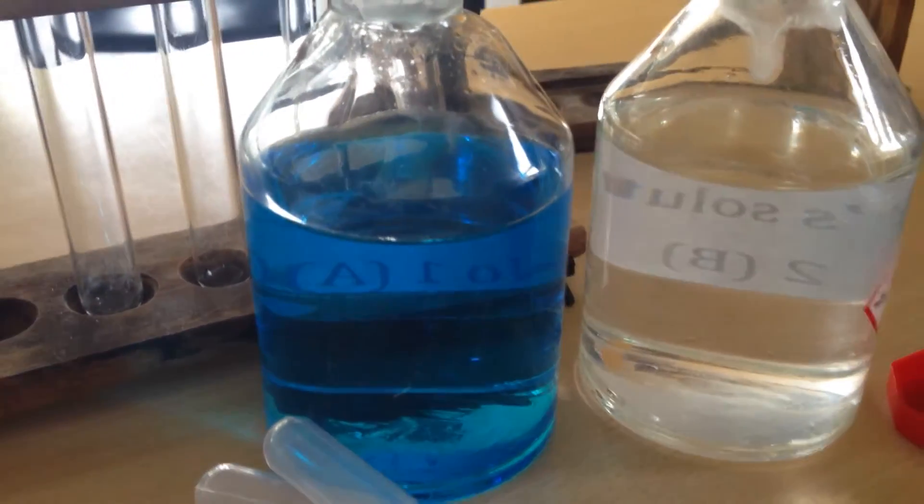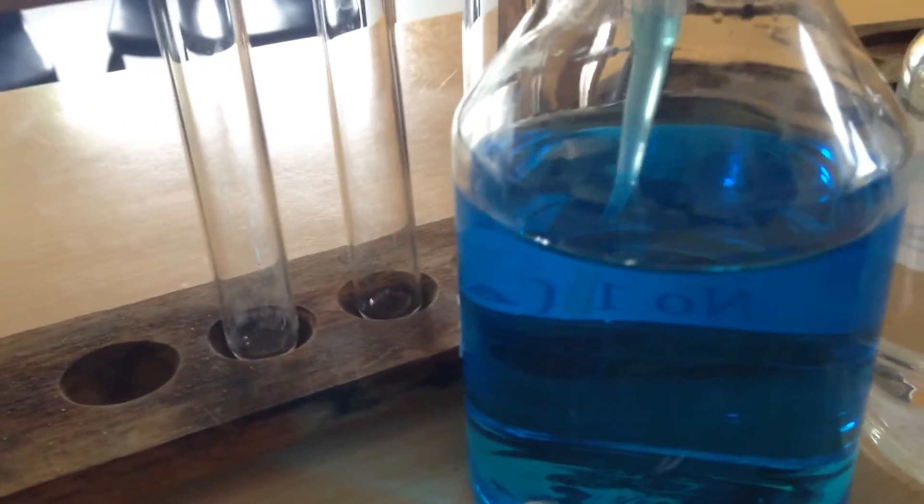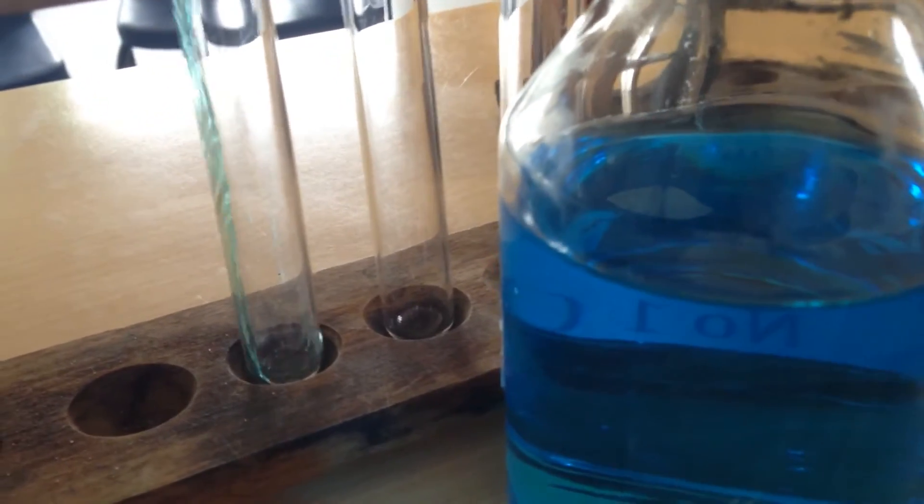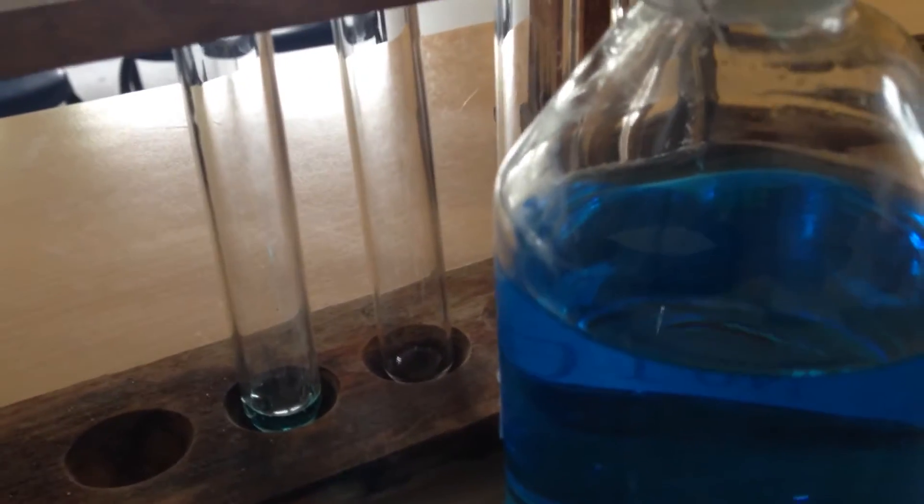This is going to be a test for an aldehyde. Here I have some Fehling's A and some Fehling's B solutions, and I'm just going to mix equal amounts of those to produce our Fehling's test reagent.